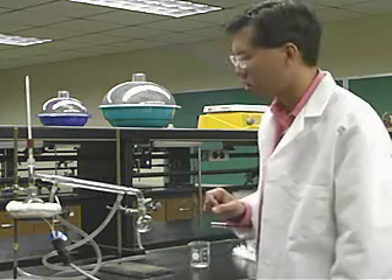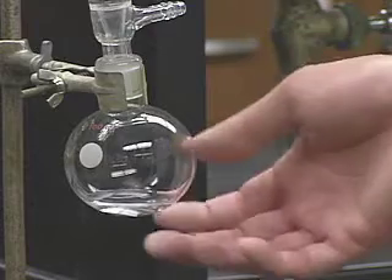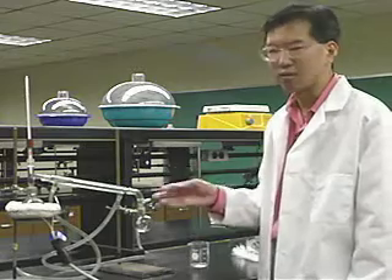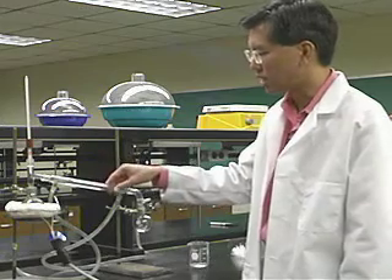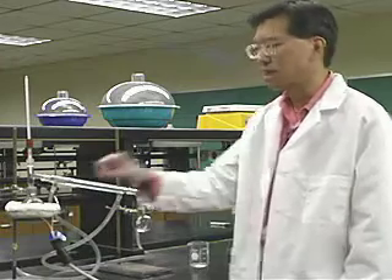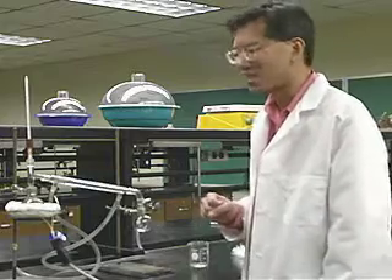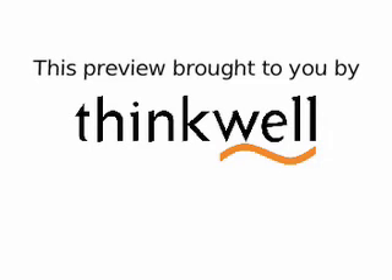The magnesium is basically serving that role in the present separation. What we're shooting for is something on the order of about a drop a second — you can go a little bit faster than that, but you don't want to go a lot faster. This is doing at a very nice rate. To summarize: we can effect a separation between a solid and a liquid where we're interested in the liquid phase by distillation, or we can separate two liquids by distillation — this is a very common technique. It is exactly the way that you would make gin, except instead of magnesium shavings you'd use juniper berries, lemon peels, and other spices. Don't make your own gin, because it's against the law.